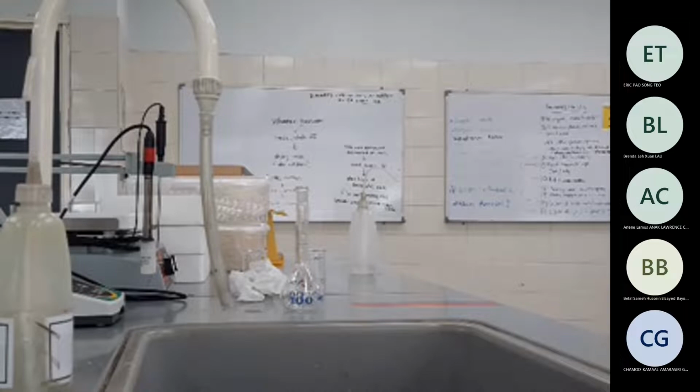So let me check first. Fume hood 1, sodium hydroxide.